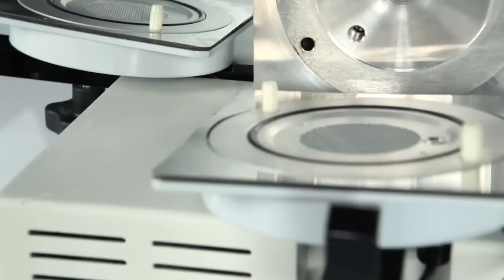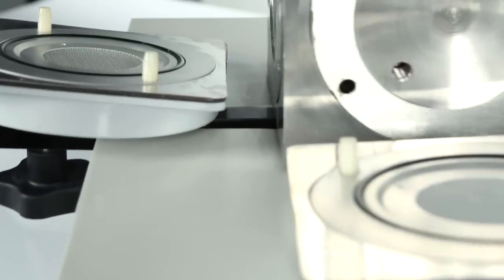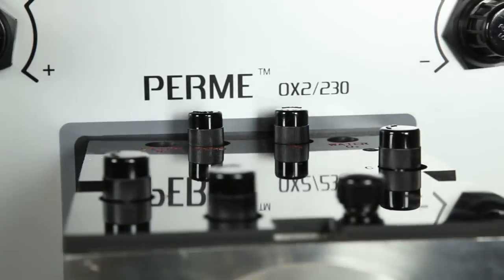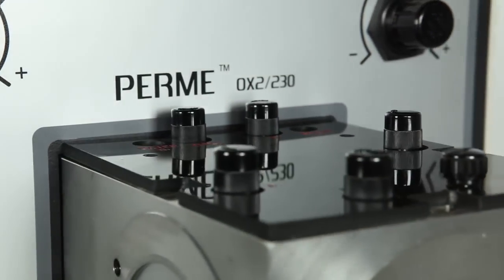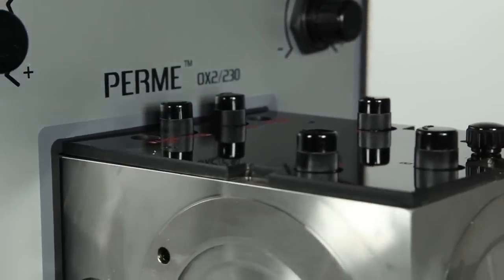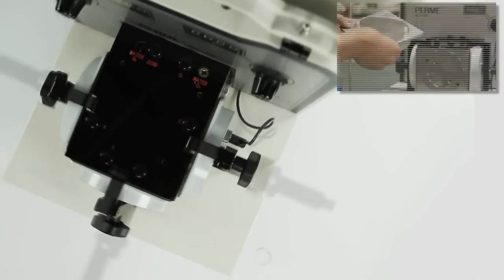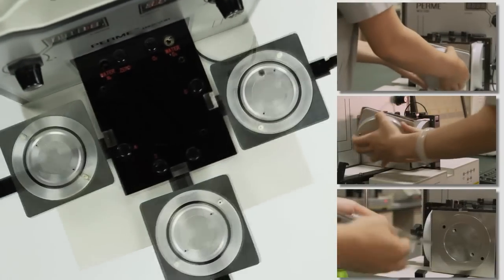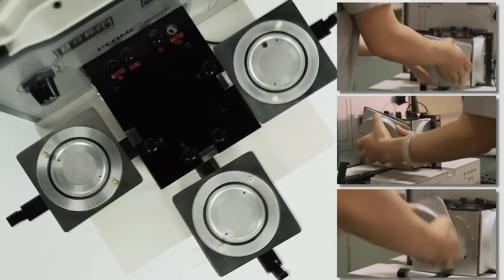It can carry out three independent tests within one unit and examine three the same or different samples under the same test condition simultaneously.